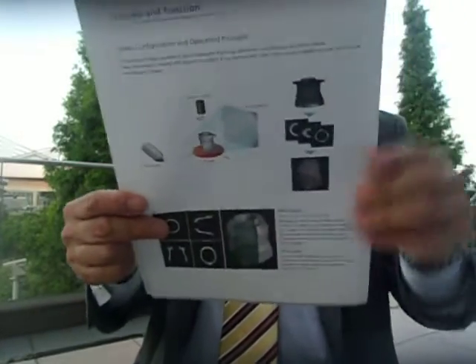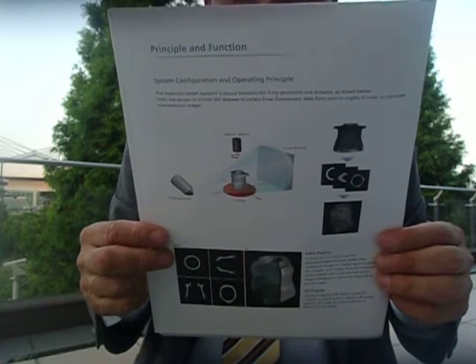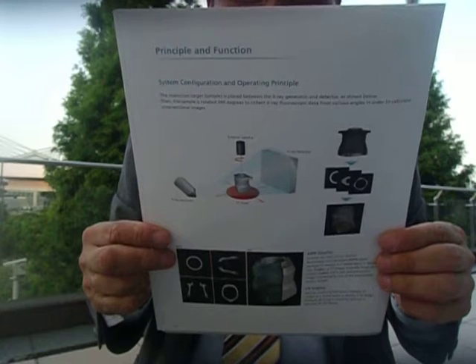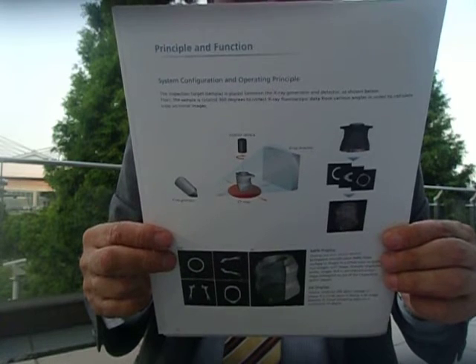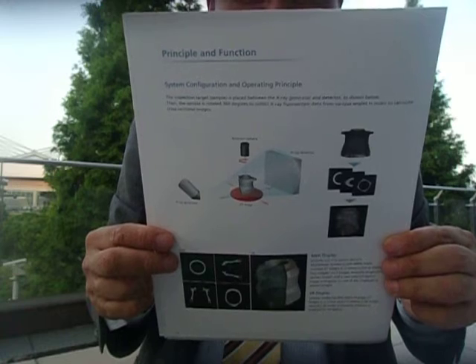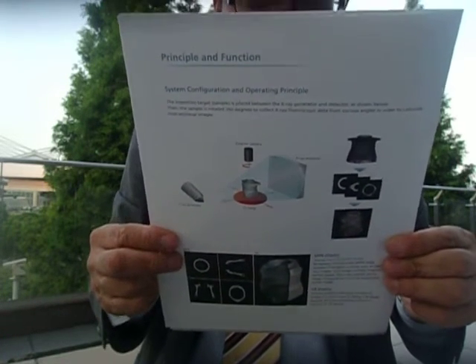Unit function. CT scan complete region or CR can be used to obtain transmission imaging without scanning in the CTZ direction by acquiring data only along the vertical center line of the X-ray detector by moving the CTZ axis vertically.